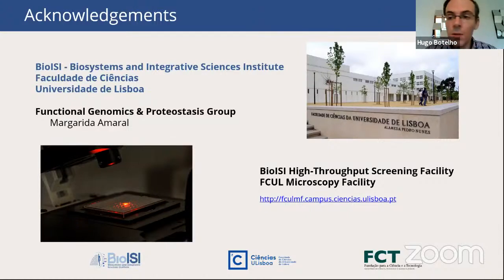The second question is what are the decisions involved in cell segmentation? This is all assay based. Each assay would have to consider a different collection of decisions. And this is why, before moving on into a large screen, every screening campaign requires a small pilot screen to be performed at the beginning to identify which are the relevant factors that need to be taken into account. I've talked about the most common ones, but this is all decided on an assay to assay basis.